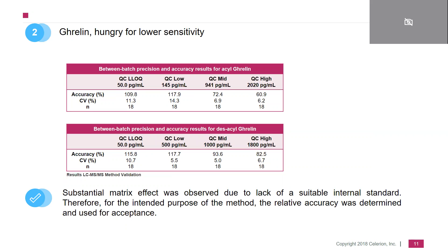Coming to the first results: the middle panel top shows between-batch precision and accuracy results for acyl ghrelin, and the lower panel for desacyl ghrelin. At the critical LLOQ level, the accuracy looks quite promising. It is a little less promising at the higher end, and this is due to a substantial matrix effect. Therefore, we decided to use relative accuracy instead of absolute accuracy, and this was deemed acceptable for the measurement of ghrelin in this human matrix.